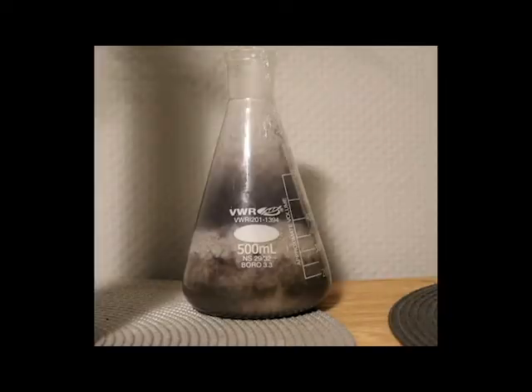This is the flask after cooling down. As you can see, there's a very thin film of black precipitate, probably carbon, on the wall of the beaker. Normally this shouldn't happen, and even though I used a new batch of oxalic acid, I don't think that this is the reason, because it should be really pure. So my only explanation is the fact that I used redistilled toluene, so probably there were some minor impurities in it that decomposed during the reflux.